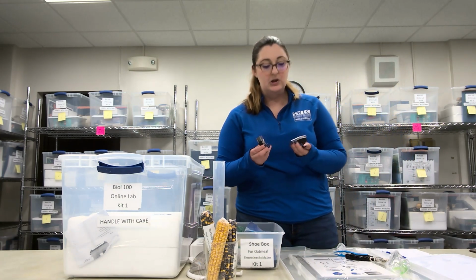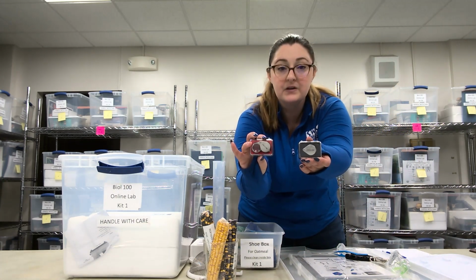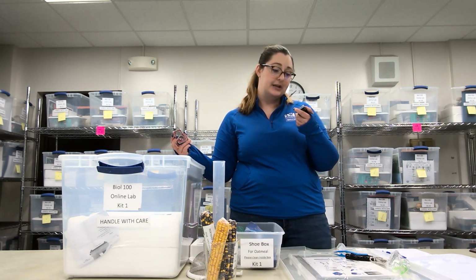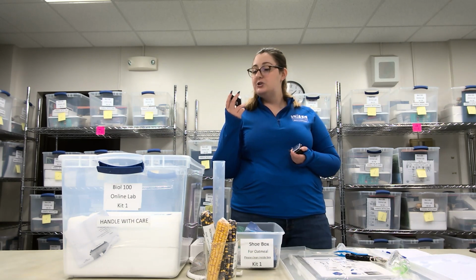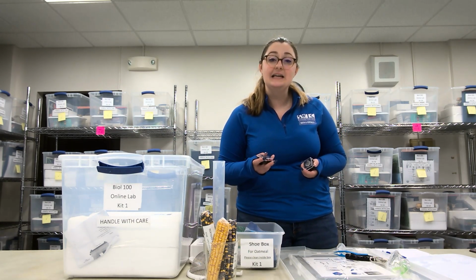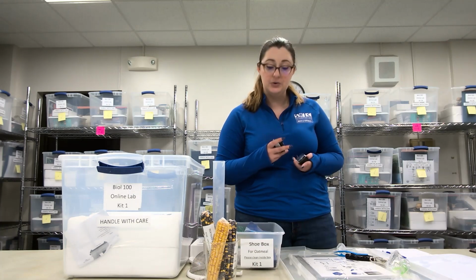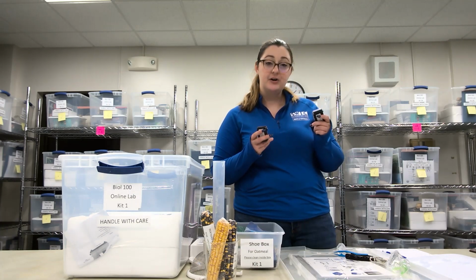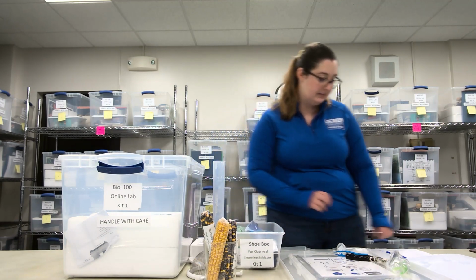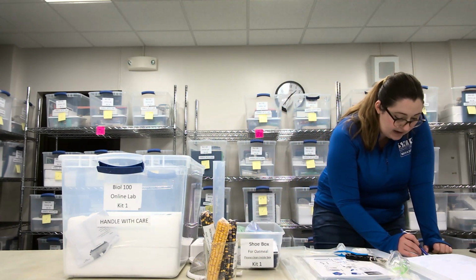From there, we have 2 jeweler's loops. These are going to look like this. You should have one that says 30x, and the other one should be either a 10x or 16x, depending on which kit you have. Either way, you should have a 30 and then a 10 to 16, 2 of them. Go ahead, put them in, check off that you have both.